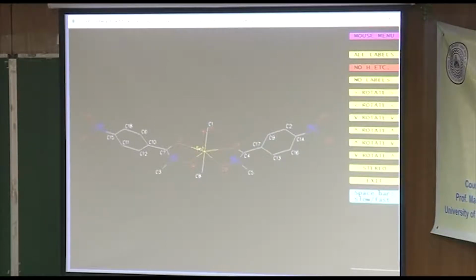And the program is going to automatically change the SFAC for you when you do this, so you don't need to worry about the SFAC number. Then you might say, well, C1 and C8, are those really carbons bonded to the tin? Yeah, you can have that. How will we know if those are carbons? Look for hydrogens, see if it's a methyl group. You see which ones I'm talking about? Yeah, that one and that one. You may be surprised that that could actually be a methyl group.